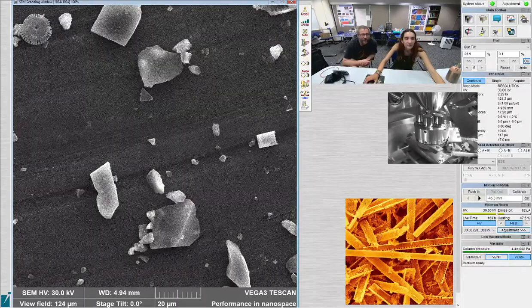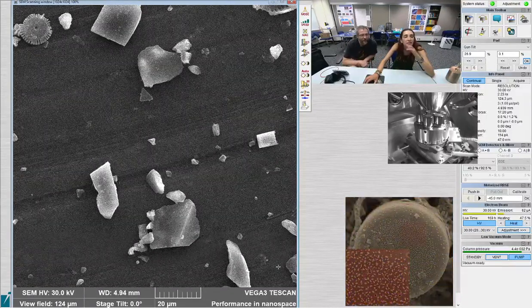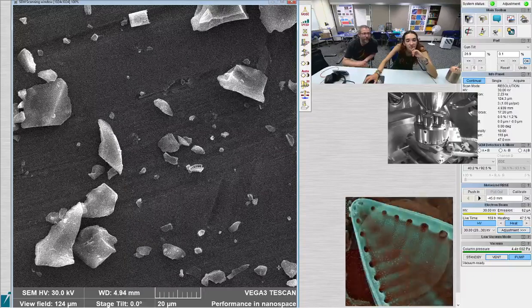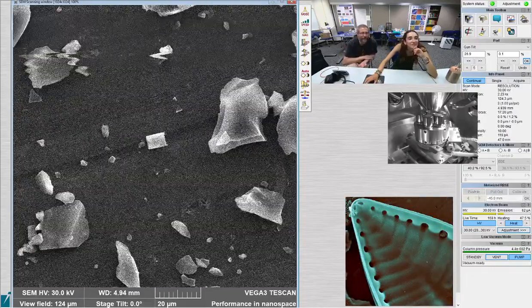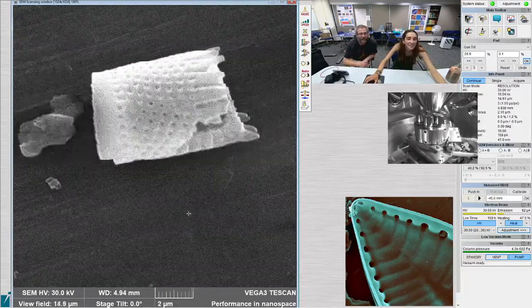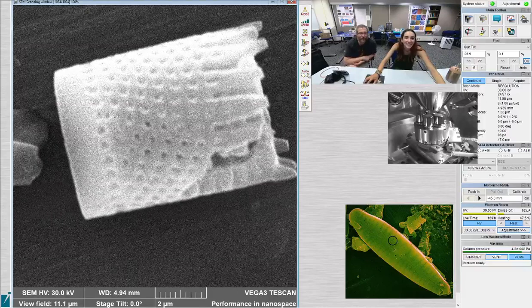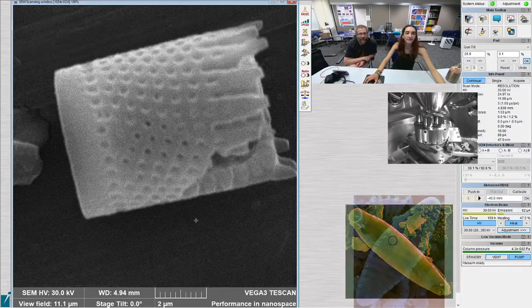The thing that I found on Wednesday with Mark and Joe was really tiny. Like 5 microns across, and anything will work if we're just trying to take pictures. Take pictures of anything you find that's a diatom that you want to image. You have no restrictions. But if we find the little guy, that's what I want to focus on. So we need some more images of the little dude.